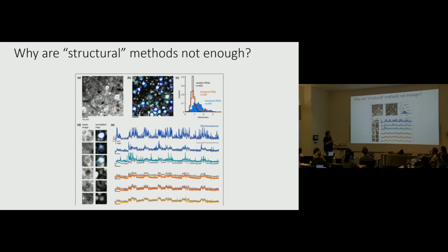You draw some kind of boundaries around it, and then we take, in this case, suite2p, a functional algorithm, and you can see that it finds relatively different things. Some things are clear on both. For example, let's take this one and that one. Those are the same cell, very clearly the same. These two cells here, these two are these two, but this one isn't there. And then these other two popped up here, but they weren't here.